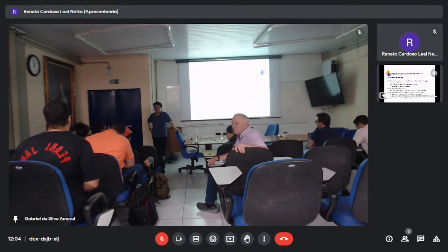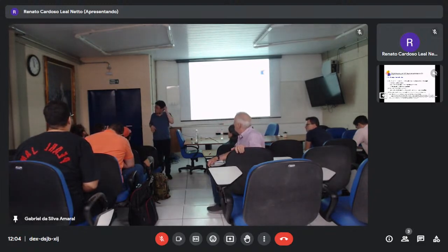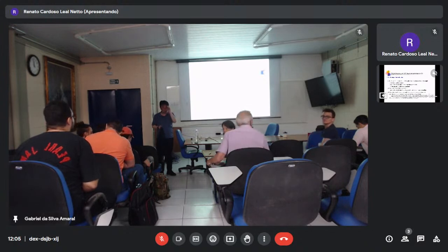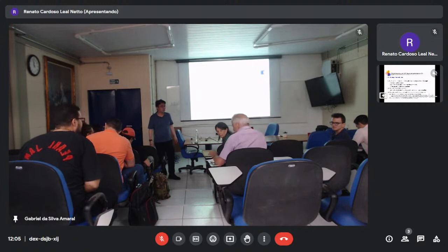We'll talk about the alignment. Why don't you want to join tomorrow? Yes, it's not an issue. I can explain right now. Any other questions? Professor, another question from Lucia Pinheiro. About normalization, when are other methods better than total intensity?